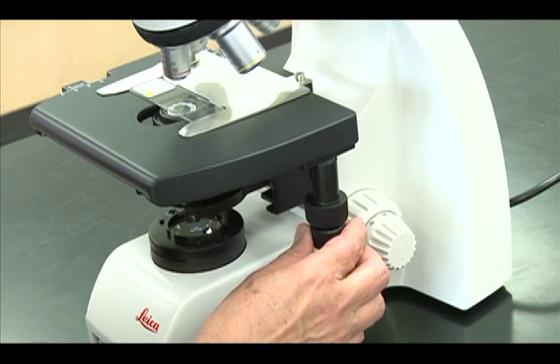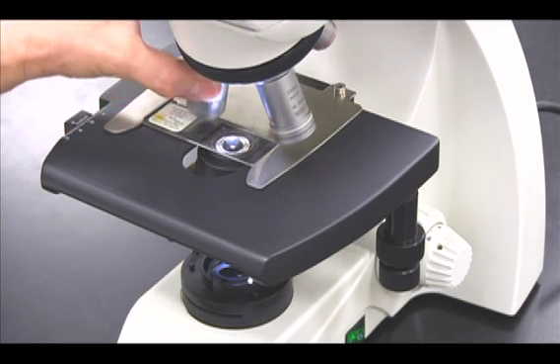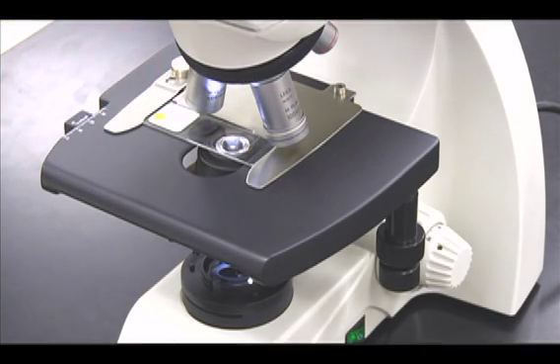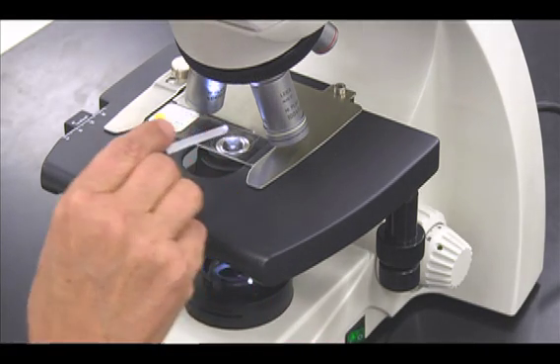To use the oil immersion objective, rotate the nose piece halfway between the 40x and the 100x objective. Place a small drop of oil in the center of the slide.